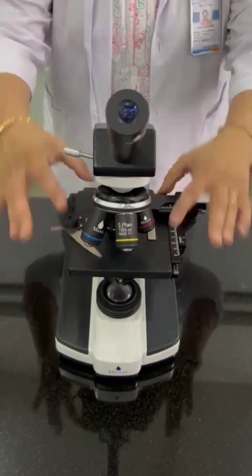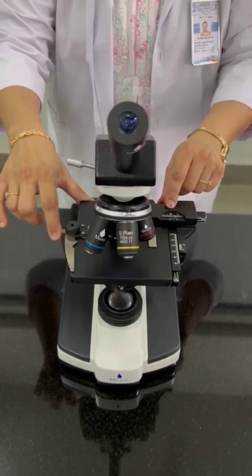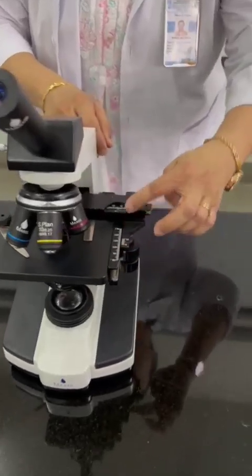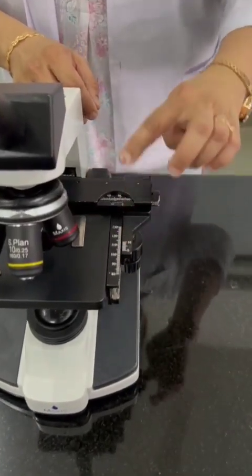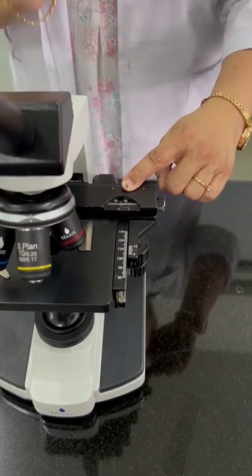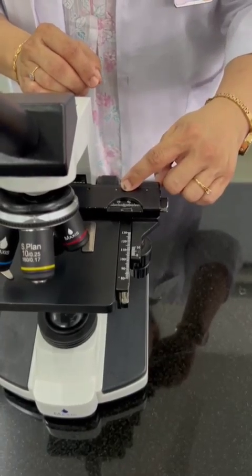This will hold the glass slide with the help of these micro threads which are present. On this, you can also appreciate the vernier scales on the X and Y axes. These vernier scales will help us to locate the focus of interest. So it can record the markings and you can see the focus of interest later.